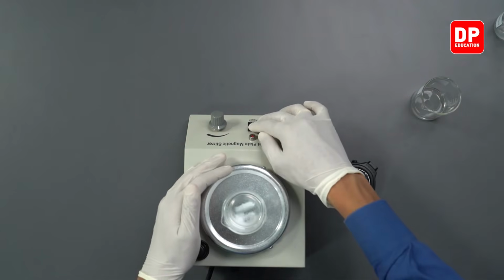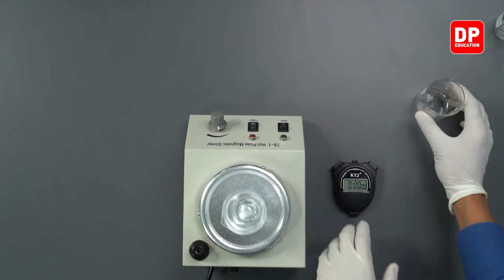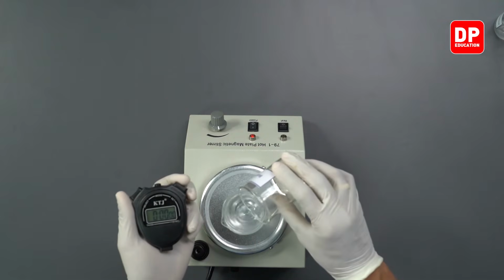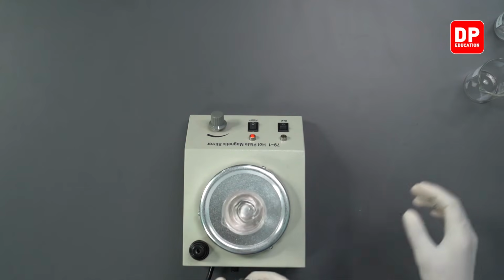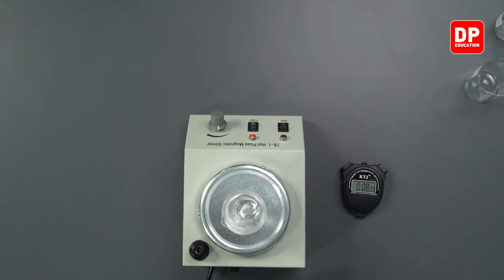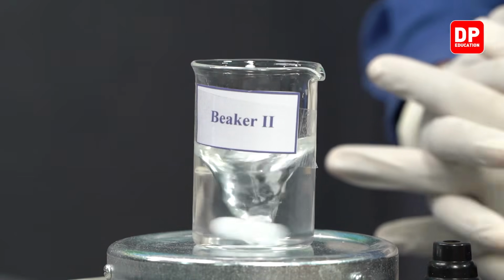So let's turn on the magnetic stirrer, and then we are going to add this Fe3 plus ion solution and start the stopwatch. And we will let this go on for about 5 minutes, and I will come back to talk about why we didn't see an observation once more.